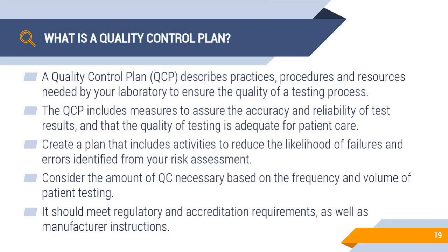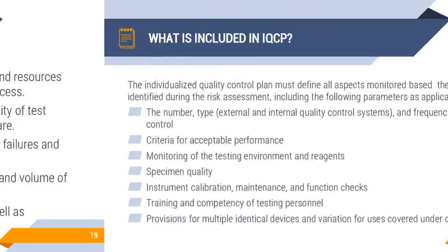Create a plan that includes activities to reduce the likelihood of the failures, as I mentioned. Consider the amount of QC necessary based on the frequency and volume of patient testing, and it should meet regulatory and accreditation requirements.